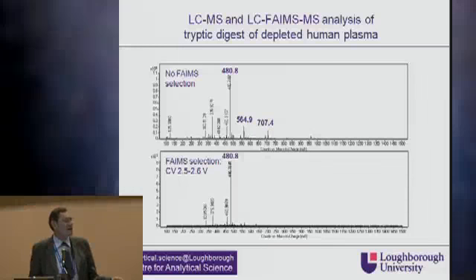We've lost the higher mass peptides which are also present, and we've reduced a lot of the noise down here at the lower levels, partly because FAIMS generally reduces chemical noise, but also is discriminating against these species at lower mass.